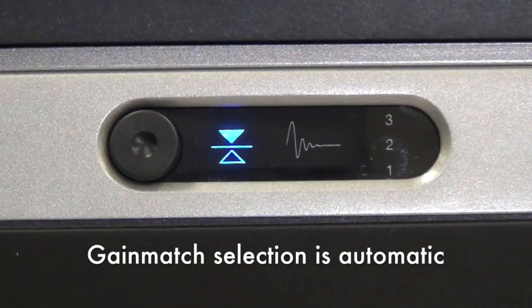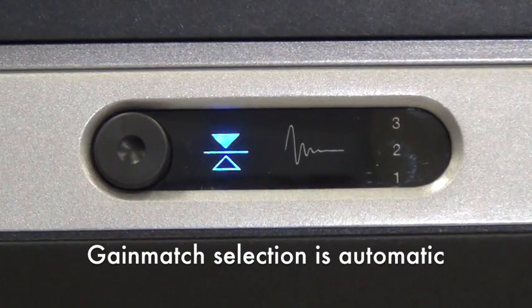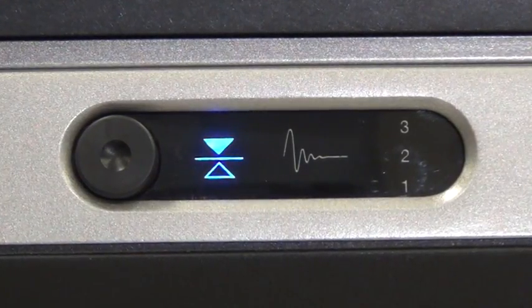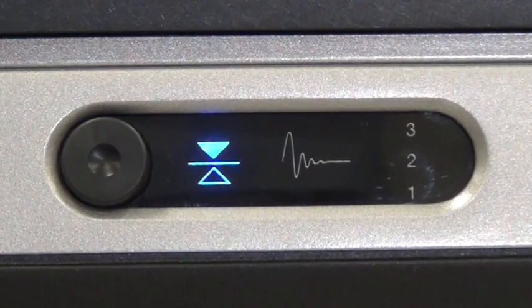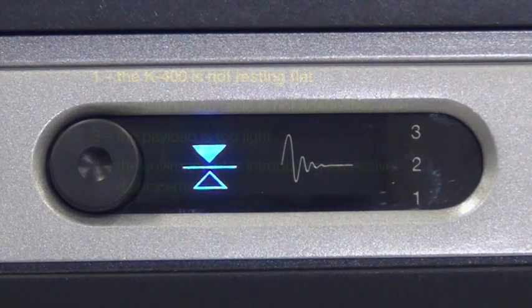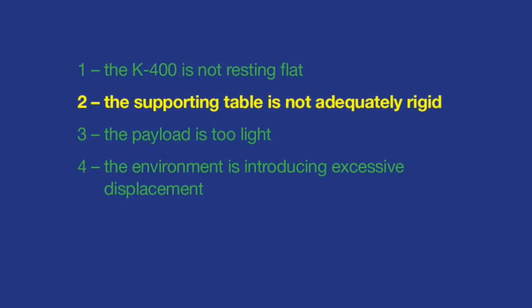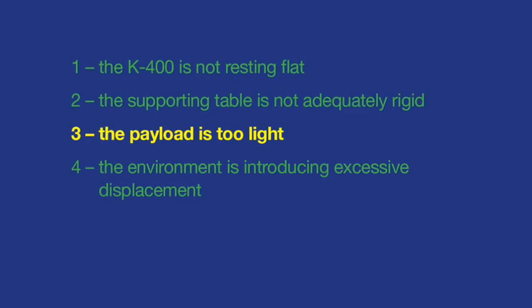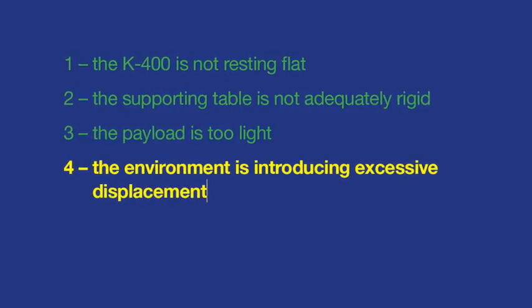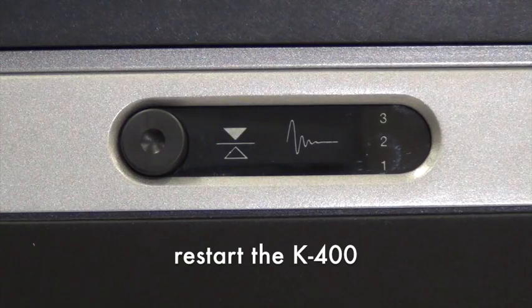The gain-match selection procedure is automatic and initiated upon startup. Occasionally — and more often if the supporting table is not adequately rigid — the procedure may result in an incorrect gain setting. When this occurs, the gain-match indicator will start to flash roughly 20 seconds after the procedure is complete and will continue to flash. This indicates that the K400 is not resting flat, the supporting table is not adequately rigid, the payload is too light, or the environment is introducing excessive displacement during the procedure. Restart the K400 when these conditions are corrected or eliminated, or contact TMC for assistance.